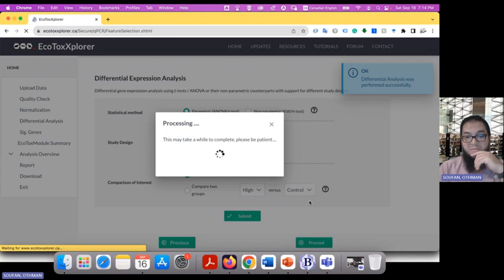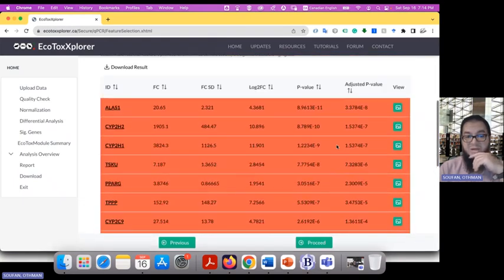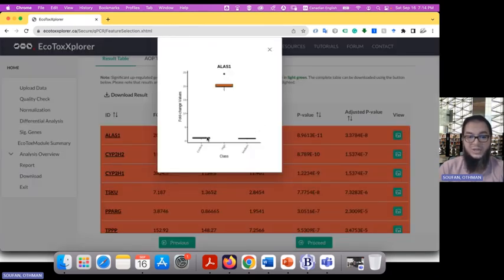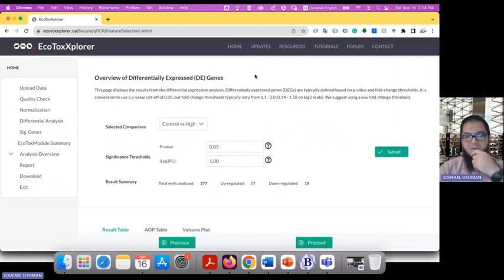And then we'll be able to see differential expression analysis and see, based on the qPCR analysis, which genes are showing a very interesting pattern in terms of a change of values across the control, high and medium in this case. Like this gene specifically here shows more response on the high dose as compared to the other classes or cases. Okay, maybe something we'll dive more into in the future.